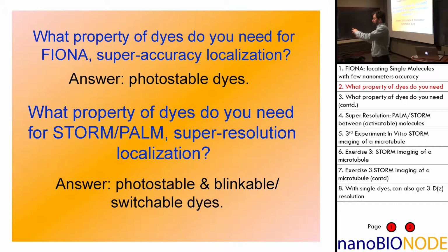That is actually understood, and that is not a triplet state. And then you knock that other state into the fluorescing state. And in terms of other molecules, you shine this strong light on it and it goes into some sort of dark state, which you can then slowly recover from.